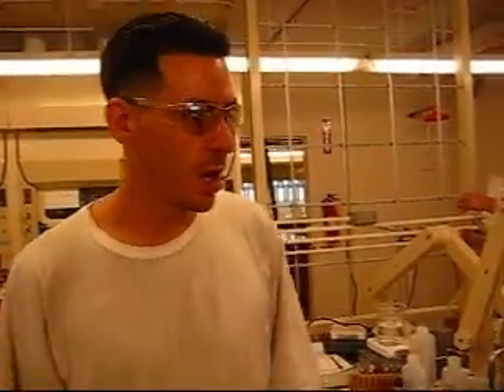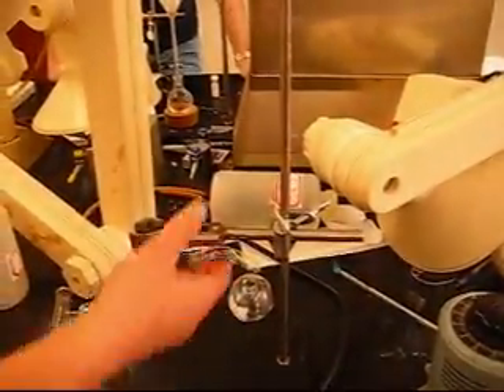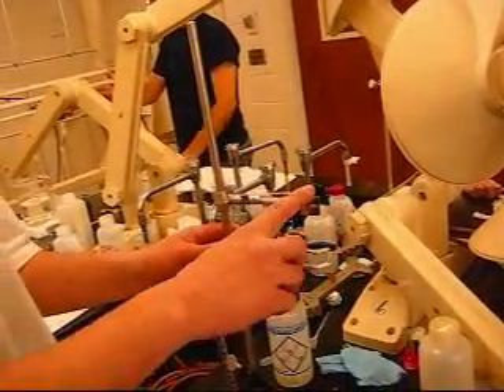What I'm going to show you today is how to set up a simple distillation. All you need to do is get two of these stands right here, along with clamps. This is a clamp right here, and there are going to be two clamps on this one.